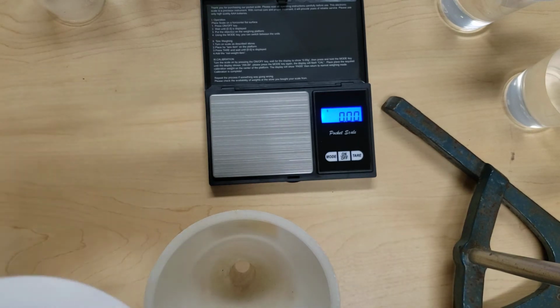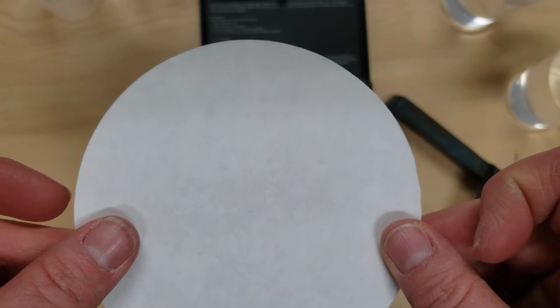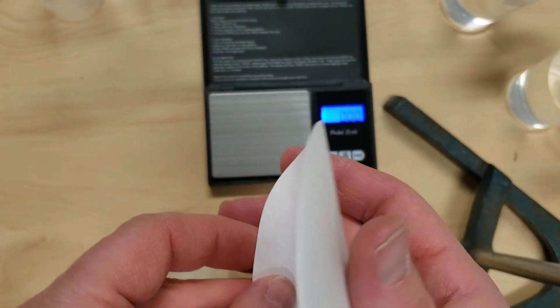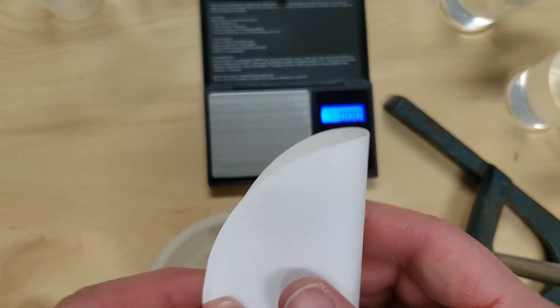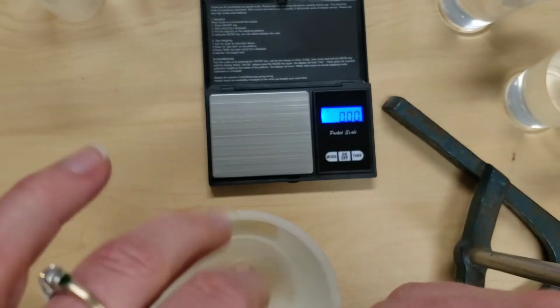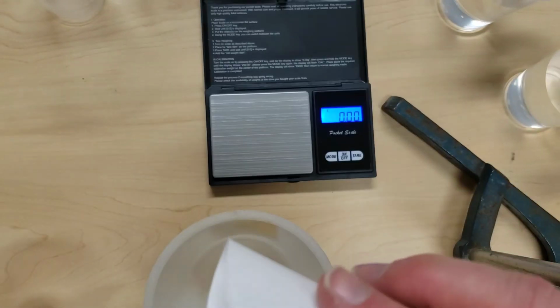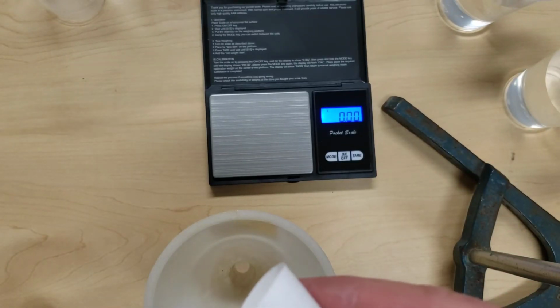And now we need to use our filter paper. In order to use the filter paper, you want to fold it in half. Fold it in half again.